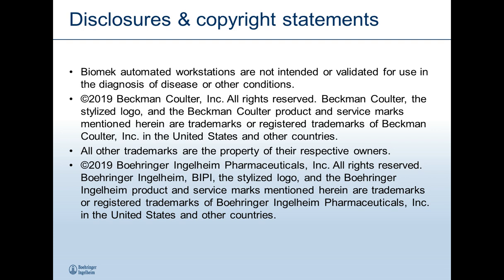What steps do you take to minimize sample-to-sample contamination during automation? Well, there's multiple ways that you can look at this, and it also depends on what types of samples you're referring to. Some people, in an effort to reduce consumables costs, institute tip wash. Most liquid handling platforms, Biomek included, usually come with the available option of a tip wash station. I would recommend a very hard, very stringent evaluation of your tip wash protocol.